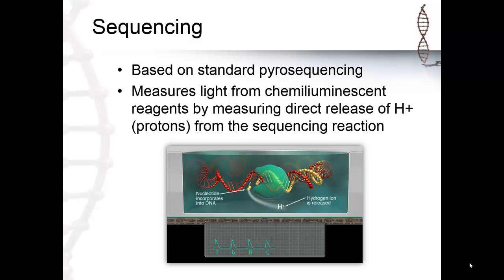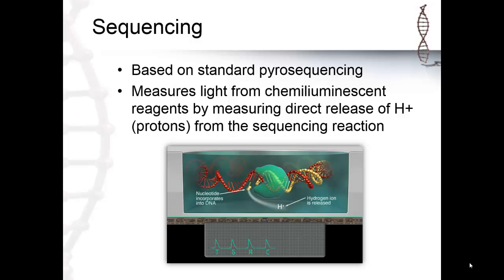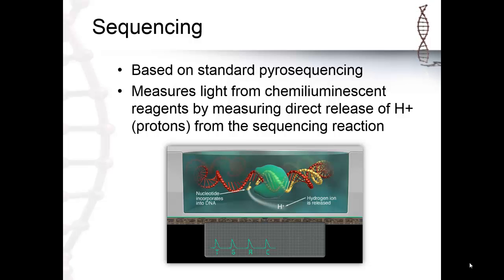While the error rates are generally pretty good at about 1%, pyrosequencing chemistry has trouble with long homo-polymers, which are stretches of the same base. Because the chemistry doesn't pause after each base incorporation, stretches of the same base result in a single, stronger signal. While short stretches can be differentiated, it becomes increasingly difficult with longer stretches.